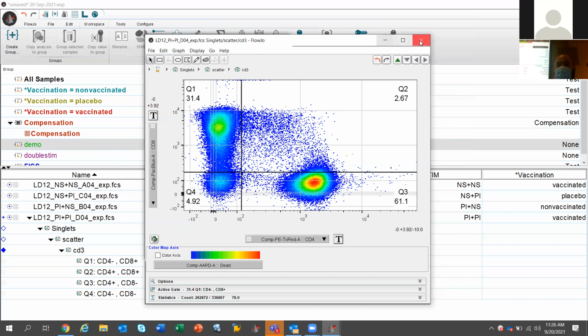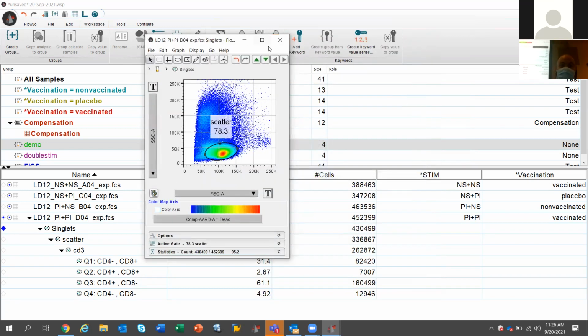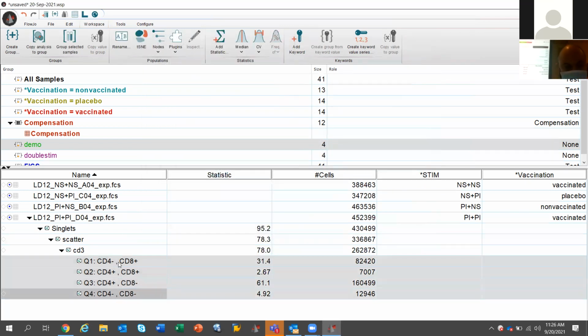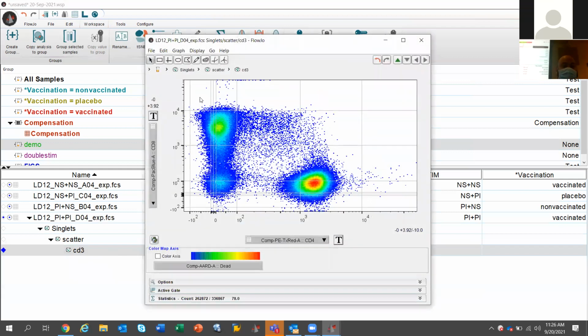So what would I do instead? Because you may say, hey, Christian, you pointed out the issue, but you didn't tell us a solution. So what I would use is this quadrant. Oops, right here, my curly quads.